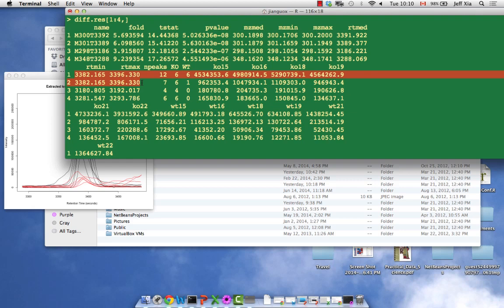So retention time alone sometimes cannot tell the difference between two peaks, and that's probably not aligned. So here you see retention time, and another dimension is mass. The m/z is slightly different between these. So we can select peaks based on mass and retention time, or based on just a single one. I think the reason is because they belong to different peaks, that's not aligned. They have the same retention time here, but they are two different peaks, right? This is 300, 301. They're not perfectly aligned, because in this range there are multiple peaks, and that's all real, and they're not supposed to be aligned.